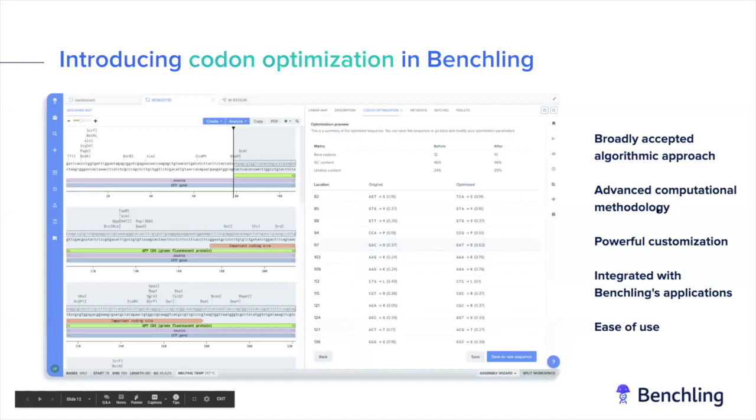But let me just step forward. For codon optimization, we've taken an open source algorithm called DNA Chisel and use that to power a lot of our codon optimization actions in the backend. There are a number of different parameters it looks to optimize on, not just removing rare codon usage. I will say the algorithm doesn't explicitly choose; there is no prefixed or preferred codon that it picks every single time. It doesn't just use the most common codon to eliminate rare codon usage.